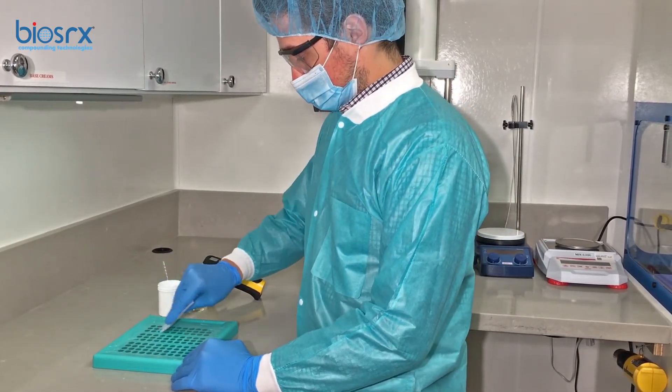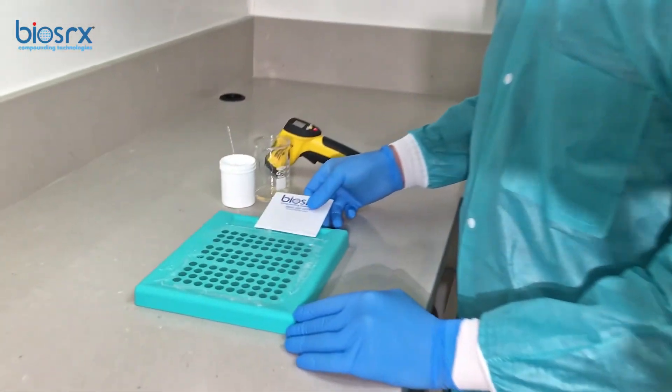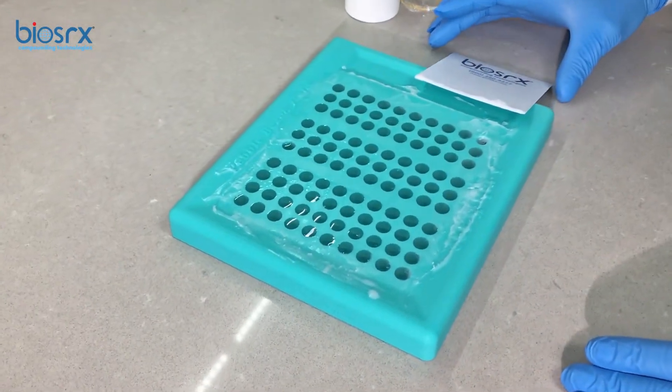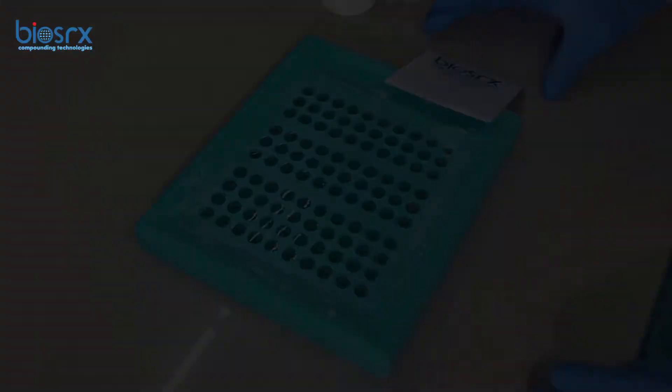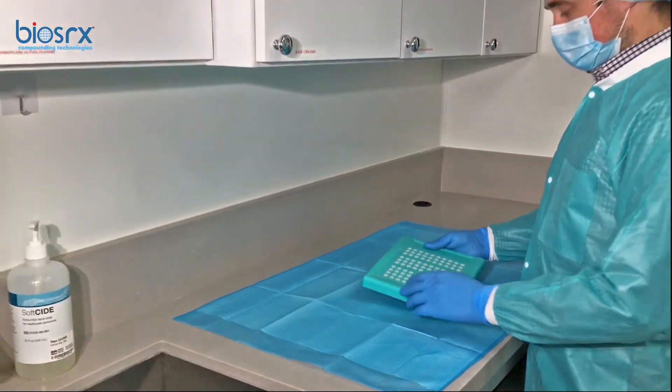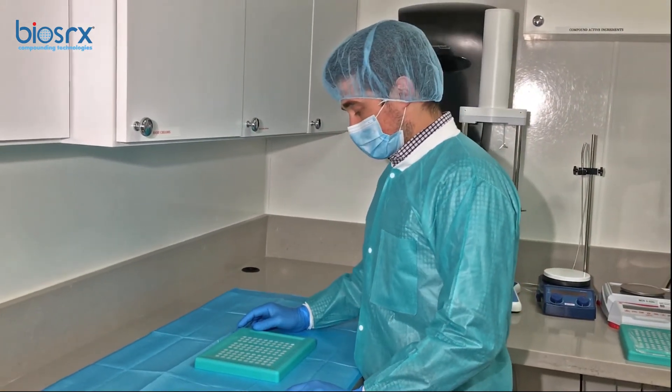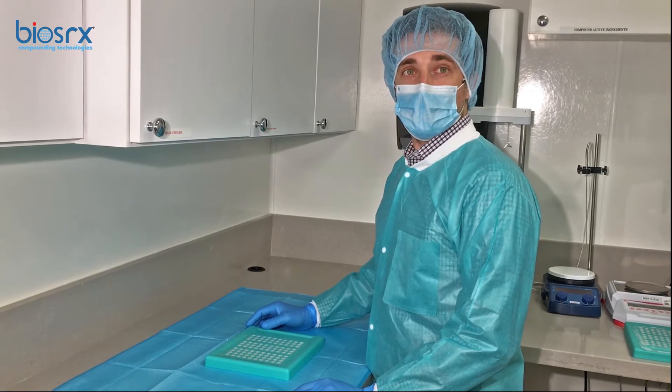And he's swiping everything. Alex is using a PEG base from PCCA.